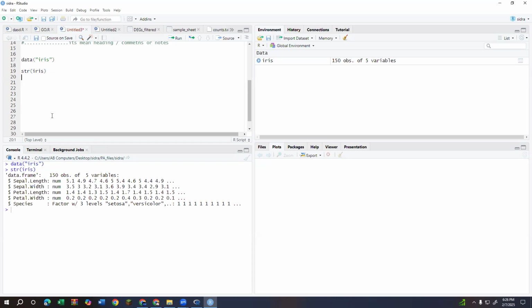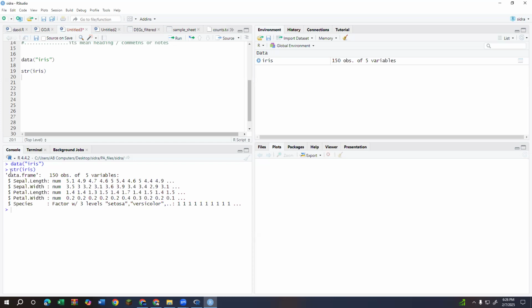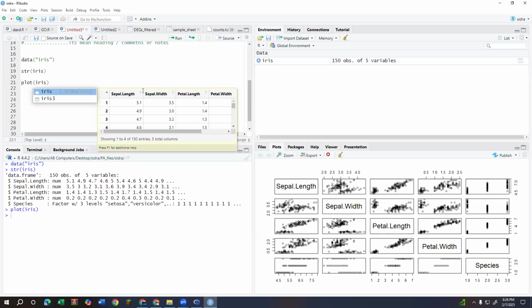Its result in the form of data appeared in screen number 2. Its result in the form of sentence, paragraph or tables appeared in screen number 2. If the result of the script is in the form of plot, it will appear in screen number 4.